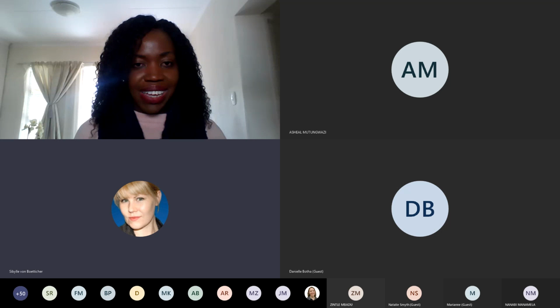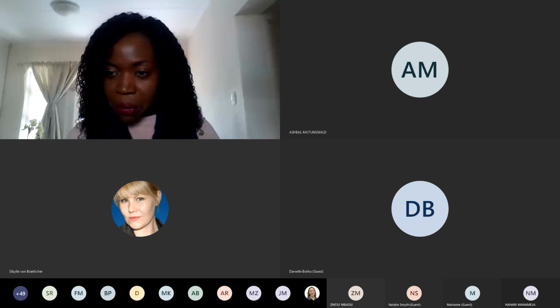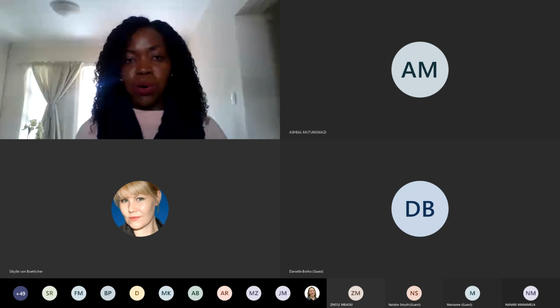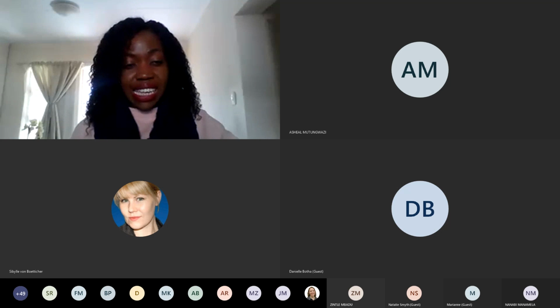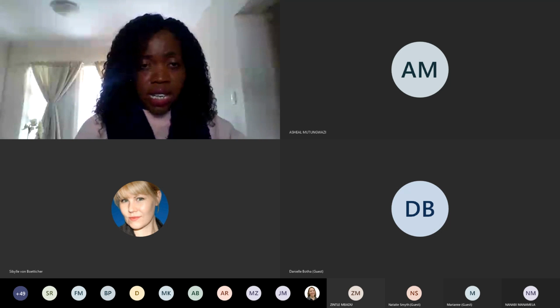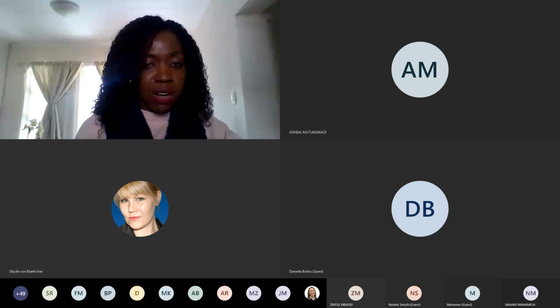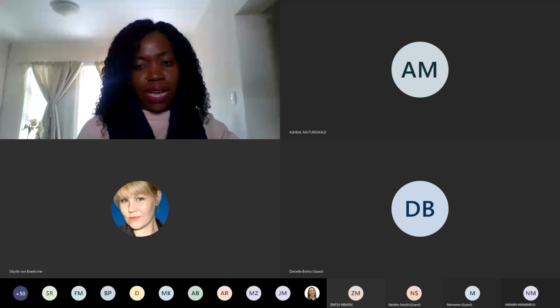There's another question in the chat box. If you maybe want to have a look at that, Maria? What are the shearing methods for DNA fragmentation into required size? Okay, so that is more into how you actually prepare your library. I'll just highlight that you can do that by sonication, or you can use tagmentation, but I won't go into the details because Maria and the team, when they look at the details of library preparation and actually the sequencing protocols, will take you through that.